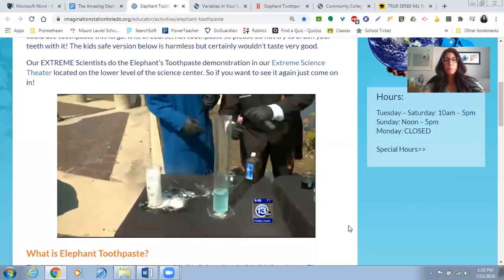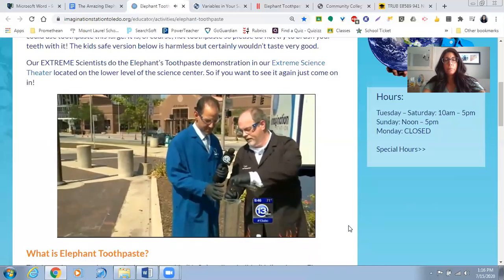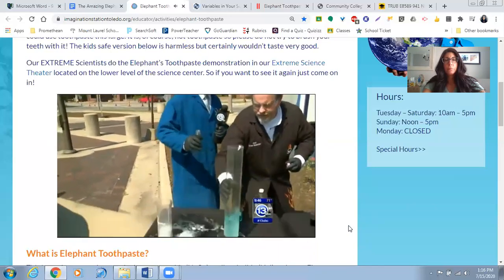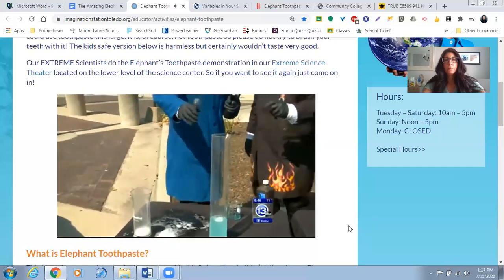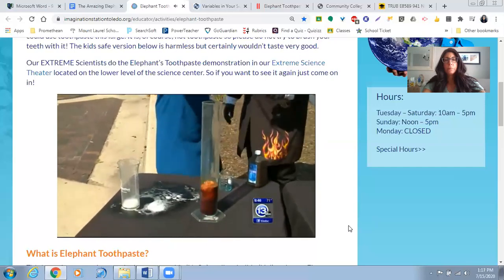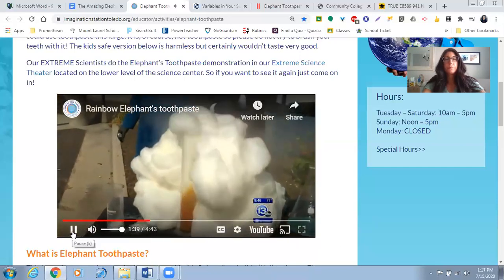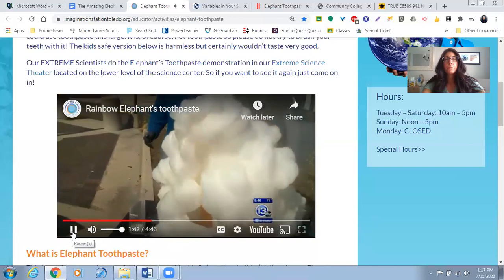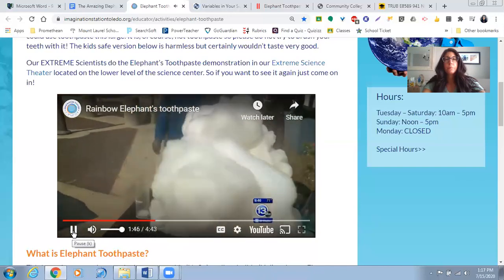Excellent. Of adding the catalyst. Now, wait just 1 second. I'm going to take the cap off. I'm going to give this to you. Let me swirl this around a little bit. Hydrogen peroxide, soap, catalyst. Go ahead and pour it in. Let's see what happens. Just dump the whole thing in. We release the oxygen inside, and you can see we generate lots of foam. It's a giant blob of oxygen-filled, soapy foam.